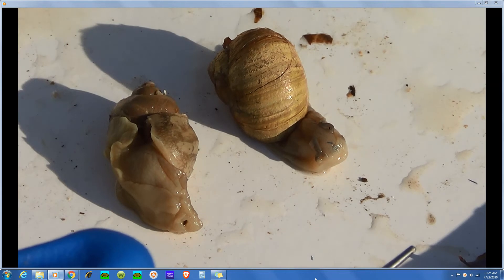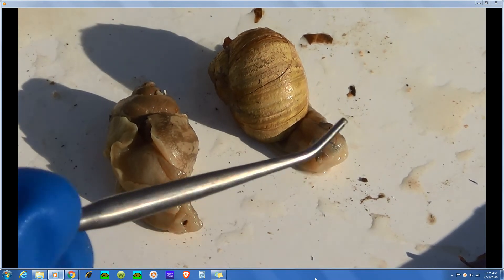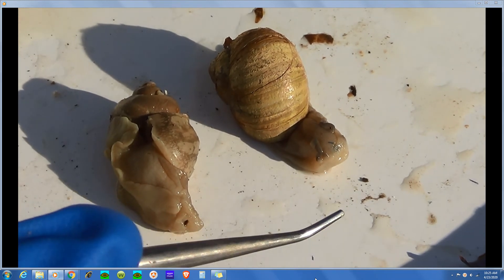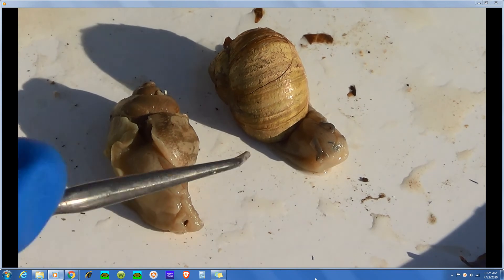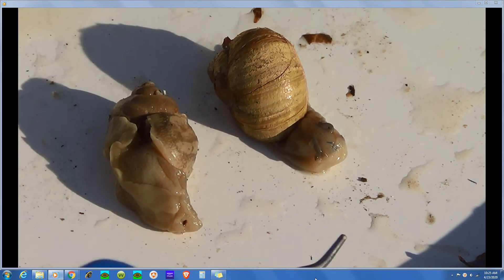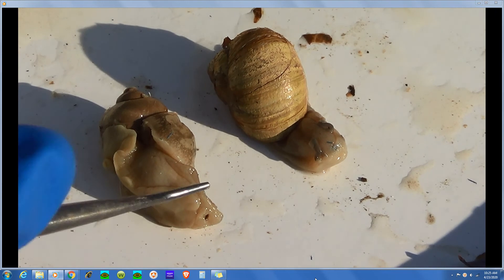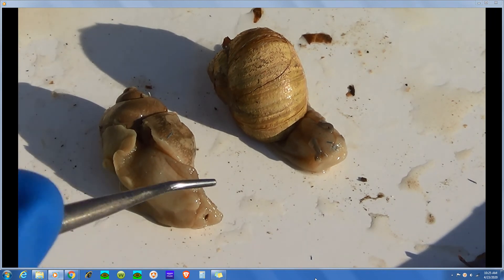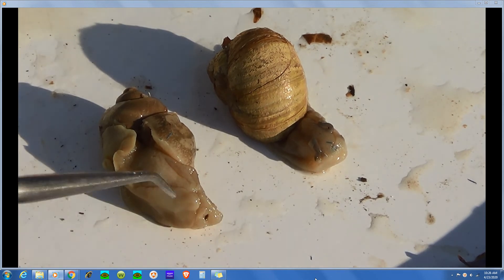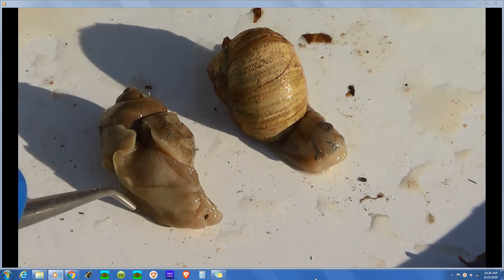They produce a good image — not like the eye spots of a flatworm that were just a light-sensitive depression. These are well-developed eyes with lenses that produce a clear image, and these things can see very well. The head foot is where the head would be, and where the muscular foot — which it uses for locomotion — is flattened along the belly side of the animal. Another word for belly would be gastro, like gastrulation for the gut. Since they have a wide foot on the belly, they're gastropods — belly foot.